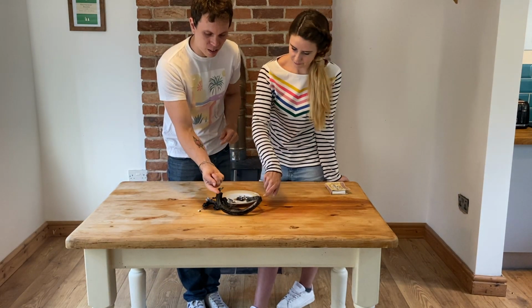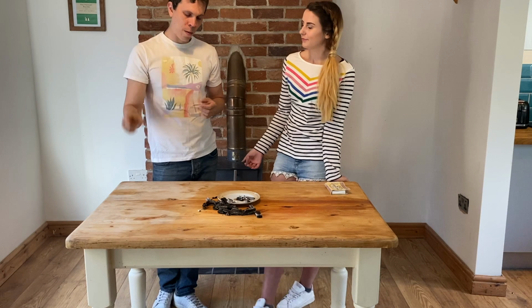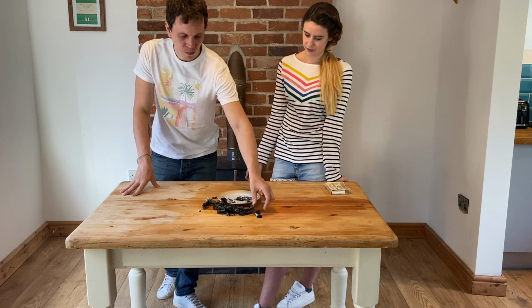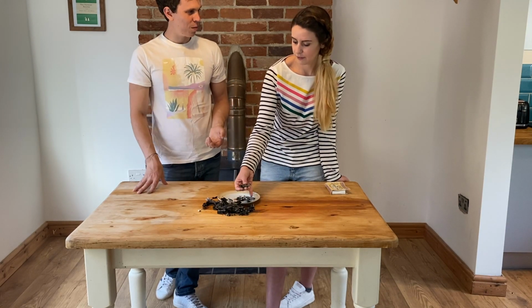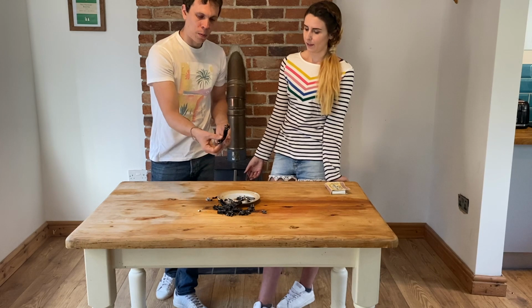I won't touch it. Oh. Yeah. It's just very porous. There's lots of air pockets inside of it. So it's really lightweight now. It feels like packaging, polystyrene packaging or something. You can barely pick it up without it falling apart in your hands.